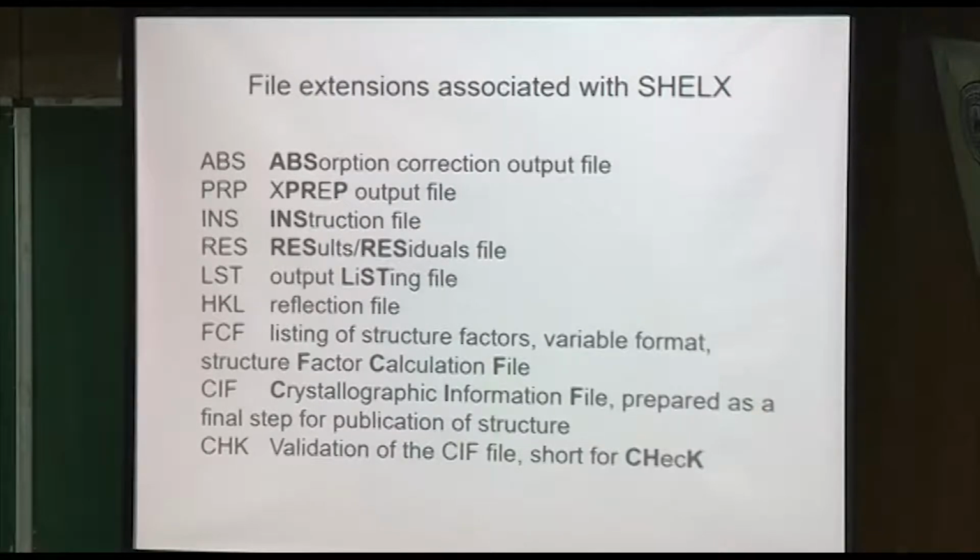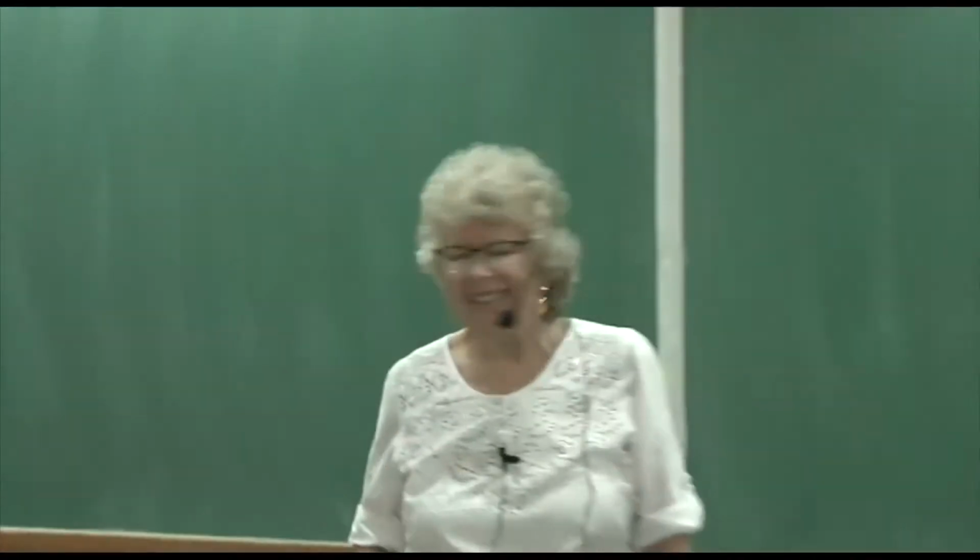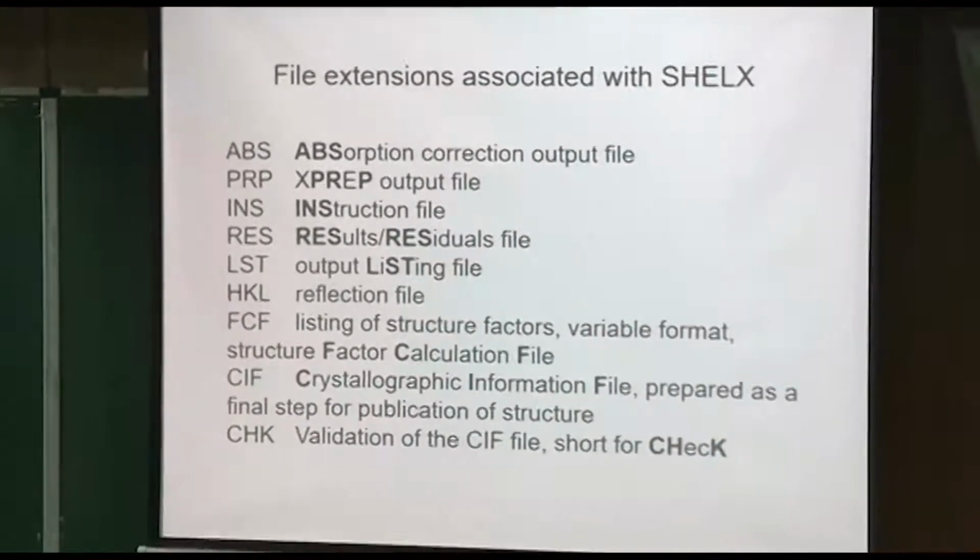And I am constantly helping people with it. And CHK is the validation file, the output file from running a CIF checker. So there are some programs now that will check your CIF for you and then spit out alerts and tell you that you made a mistake. So you have to run the CIF checker, open the CHK file, and see what the errors were. Those are just some of the file extensions, but some of the most important ones.